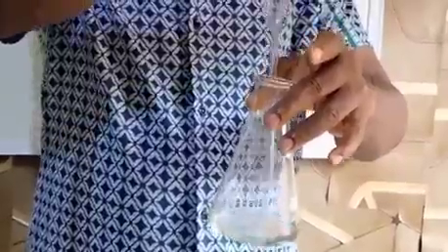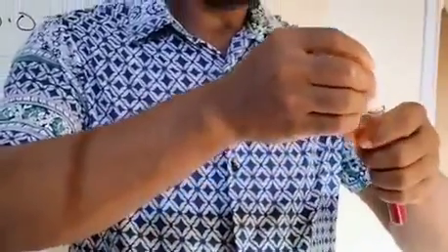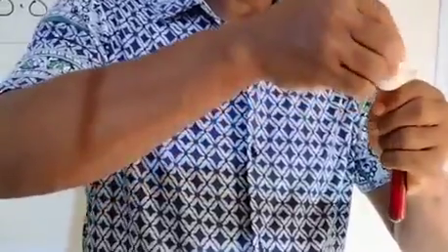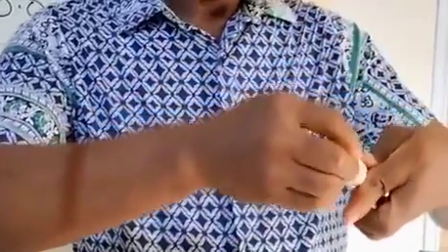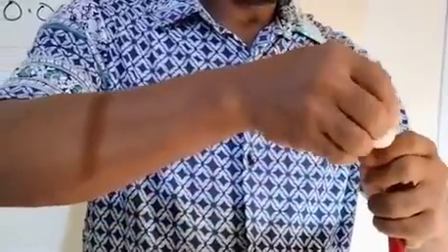So after that, we bring our indicator, methyl orange, freshly prepared. So you take it using the dropping pipette. It's still much.